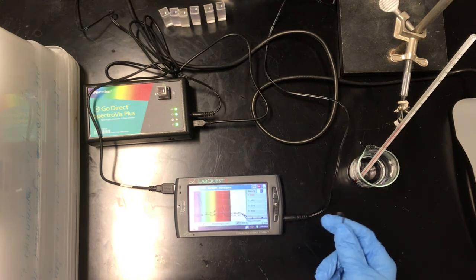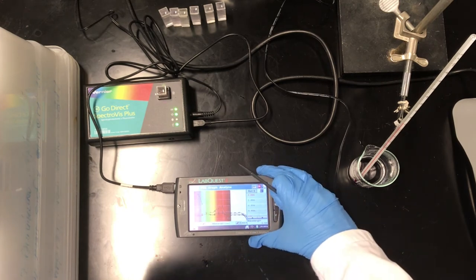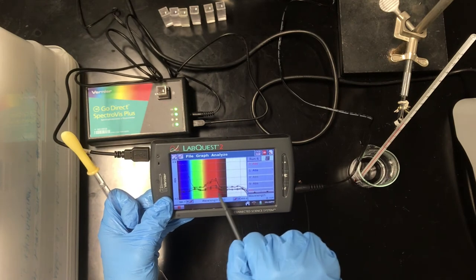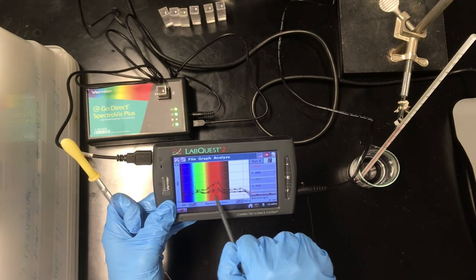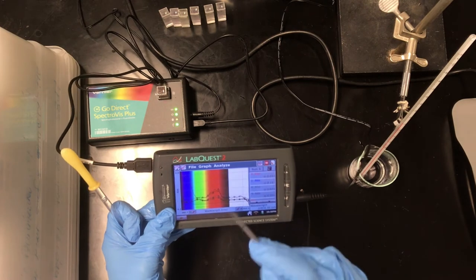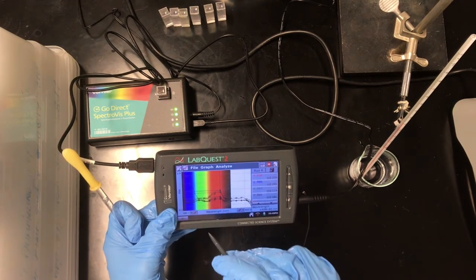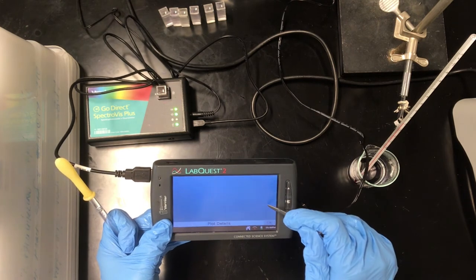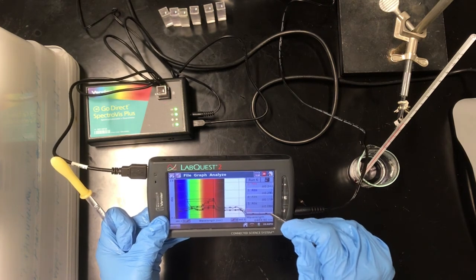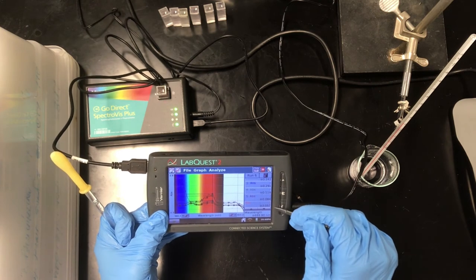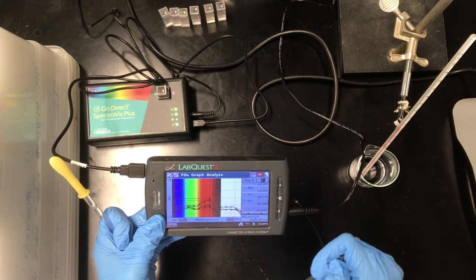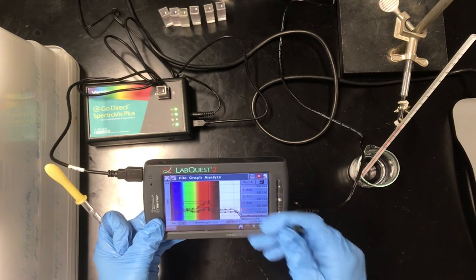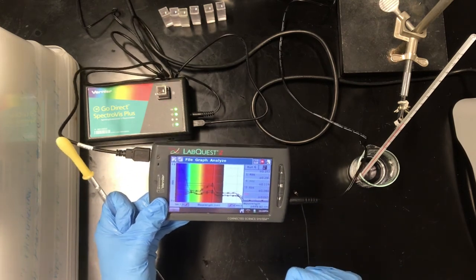Okay, so here's our last measurement, and we can see that last line just kind of crept in on the bottom here if that's difficult to see. This run is this line at the very bottom where we can see very low absorbance in that 690 region. I'll go ahead and stop it so that we can get a sense of the numbers around 690. The run we just did 0.057, which is even smaller than the 0.084 that we had in the last run. So there's a definite trend here of decreasing absorbance at 690 nanometers as the temperature decreases.